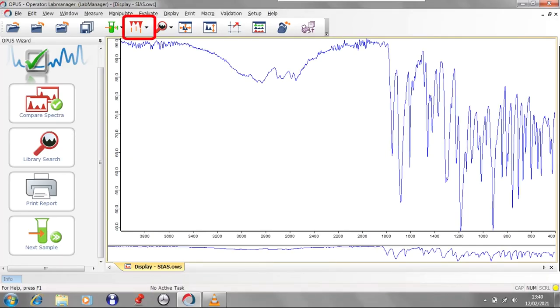You can use the peak pick, library search, and save options with solid samples in the same way you did with liquid samples.